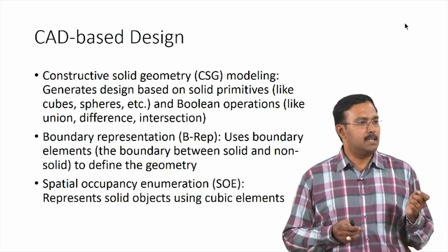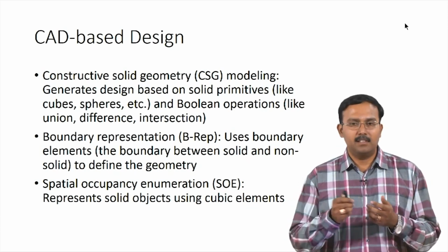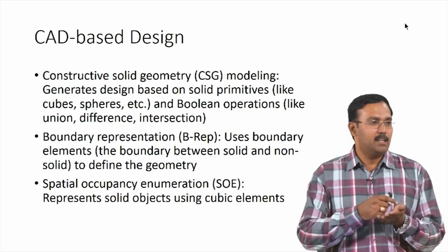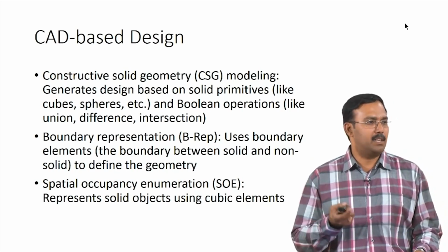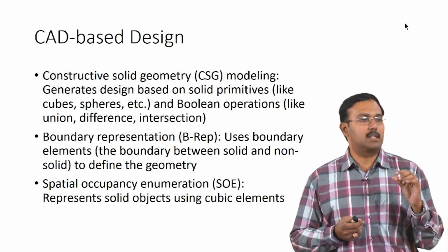So, you know pixels, right. What are pixels? The tiny squares on a 2D surface, right. If you take an image, you look at how many pixels are there. Your screen resolution is usually given in terms of pixels per square inch or something, right. Similar to that, for 3D structures there is something called voxels.